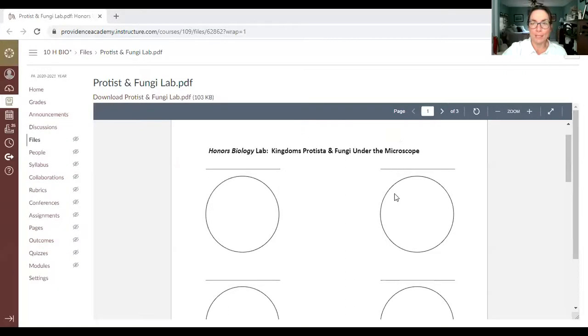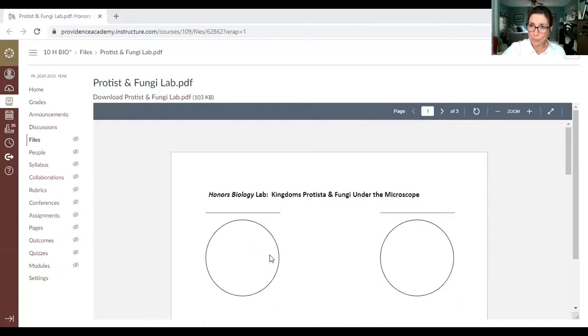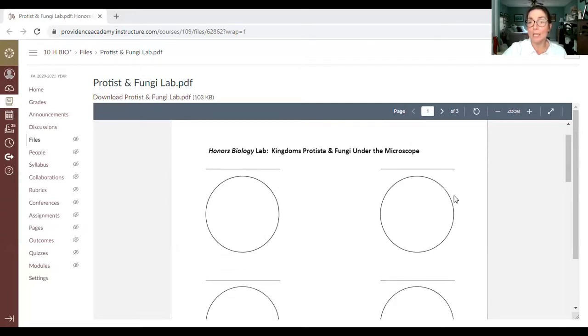At different times along the way, I'm going to have you pause the video and draw what you see on screen — that's how we'll do the first portion of this lab. You're going to need that sheet on Canvas for today — just print it out. It has spaces where you can draw what you see, spaces to put the name and magnification of the organism, and room on the sides to label properly.